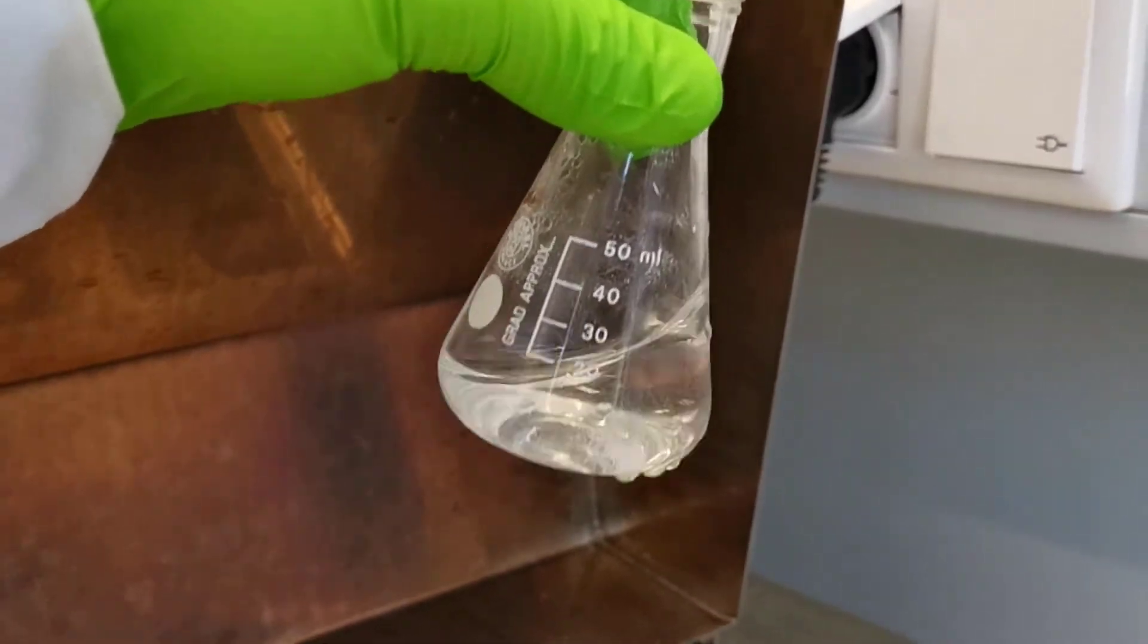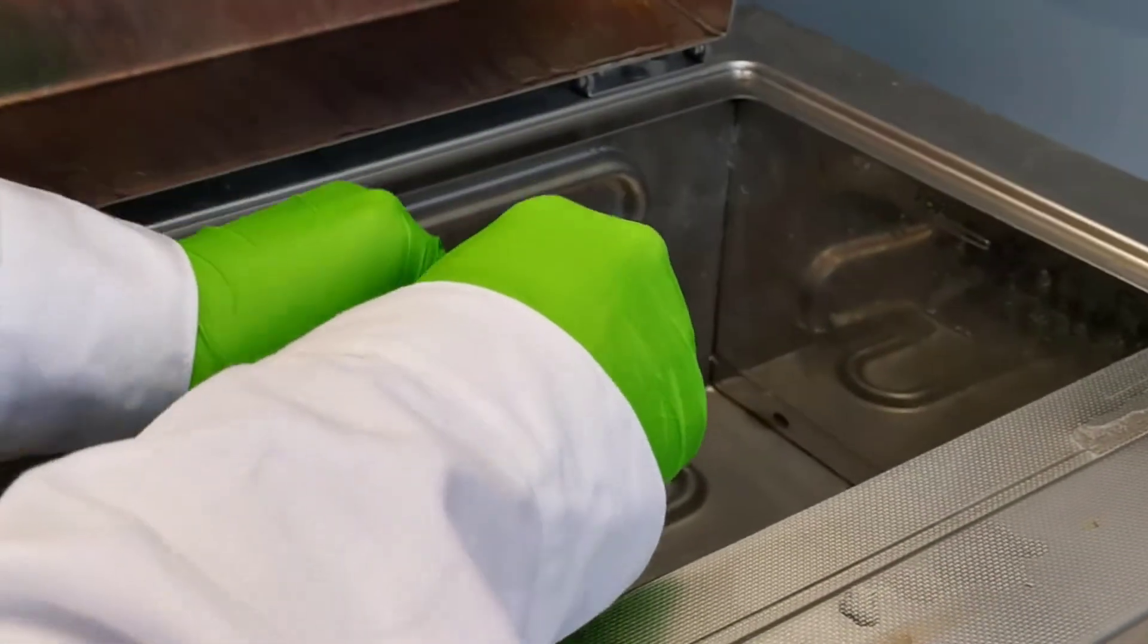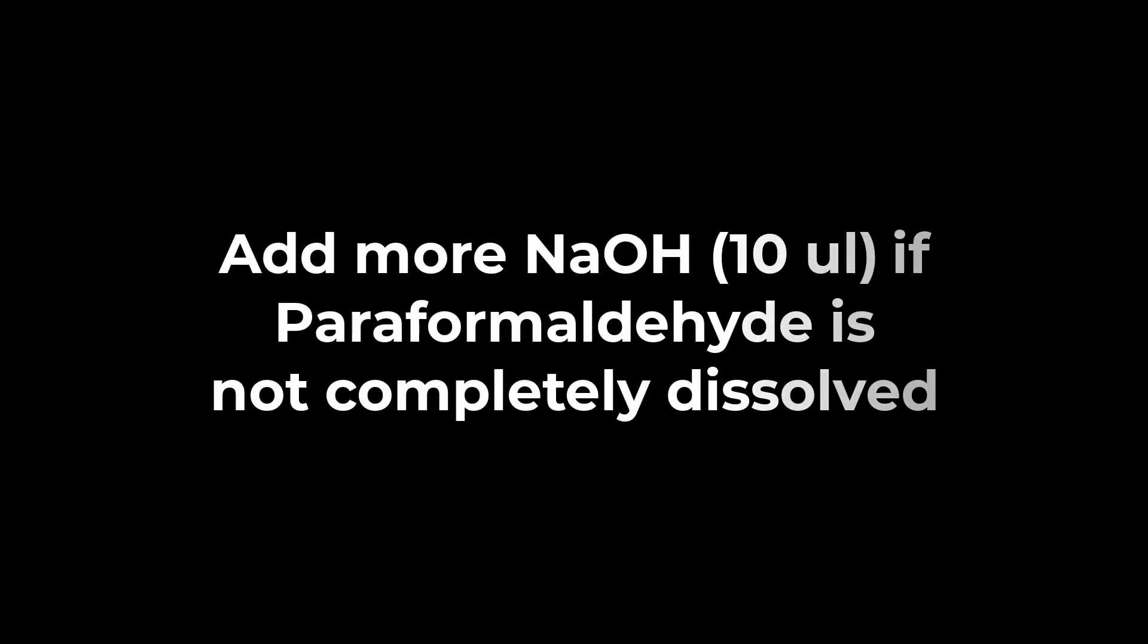We then incubate the solution for about 10 minutes and check again. If there are still undissolved PFA, add a bit more sodium hydroxide and incubate. Here, we have taken just 10 microliter of sodium hydroxide.